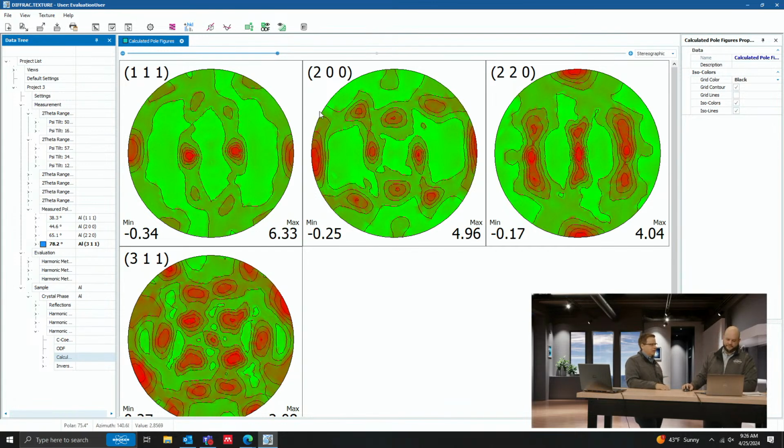Right. And again, that old thing: simpler is better. Occam's razor. You're often better going with a fit that doesn't look as good but is much simpler. And again, you want it to be grounded in reality. 100%.